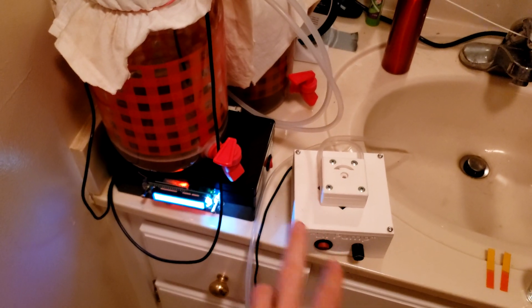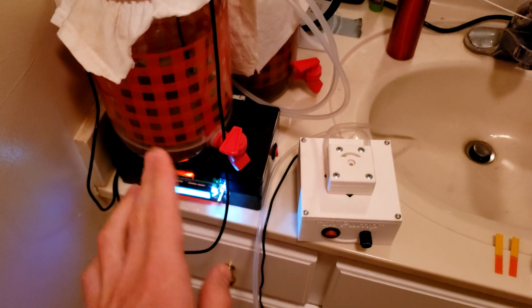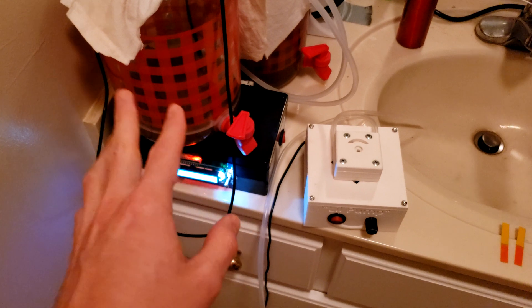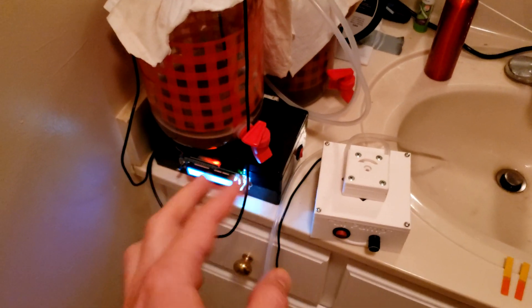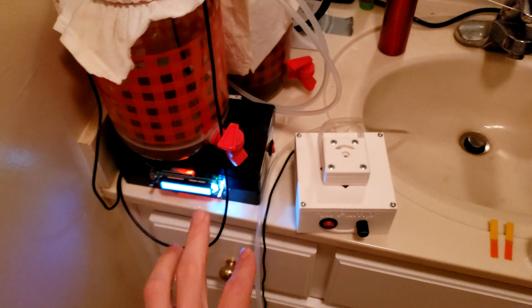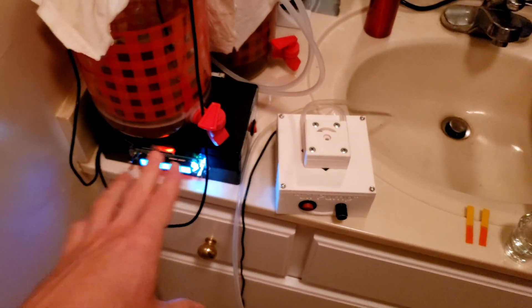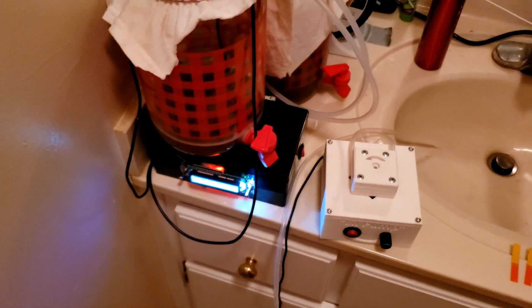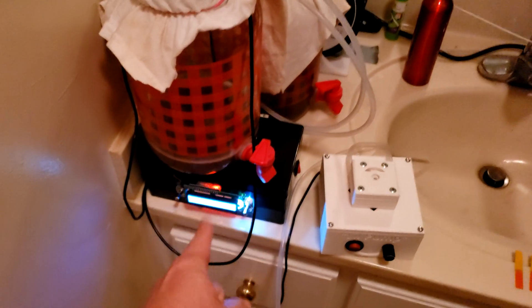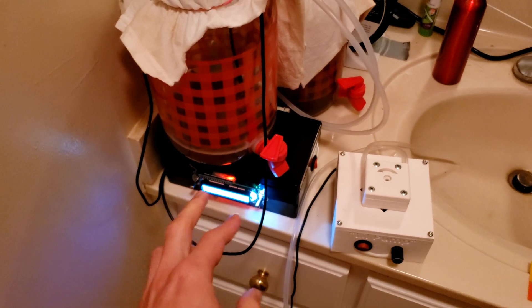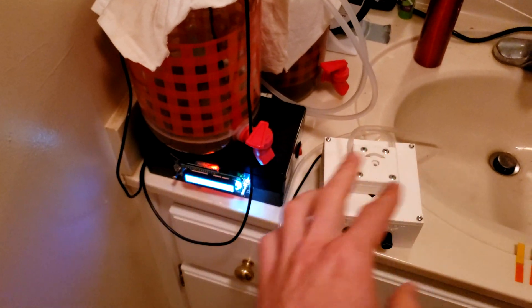So now what I'm going to do is I'm going to set up a little pump, get him all set up, try to set him to the lowest setting, let it run for 30 minutes or something and check on the level and make sure it's not going too fast. What I'll probably end up having to do is just a couple of times a day or something, let it run for 30 minutes or an hour to raise the level just a little bit. Because I don't think I can get it to a low enough setting to fill it up over four days or something like that, which would be ideal.